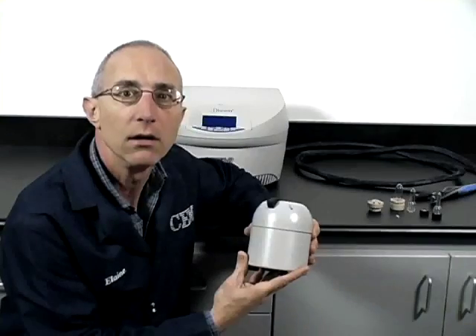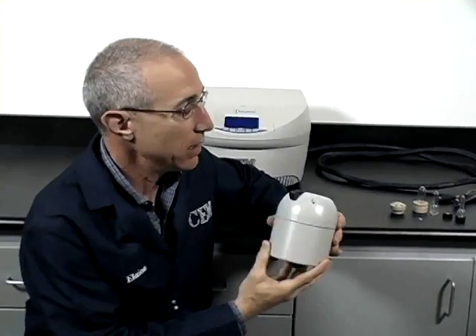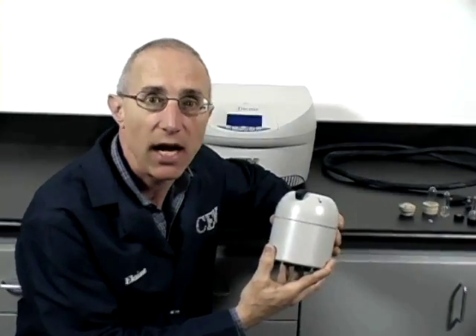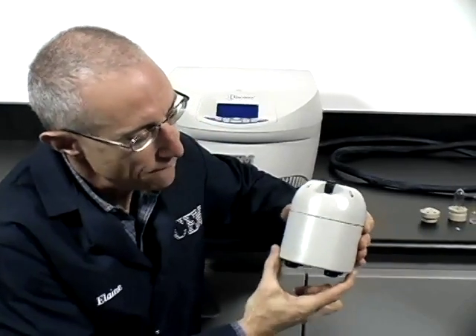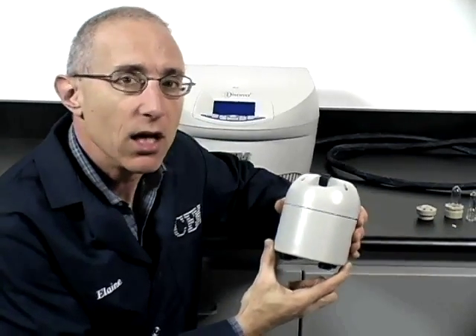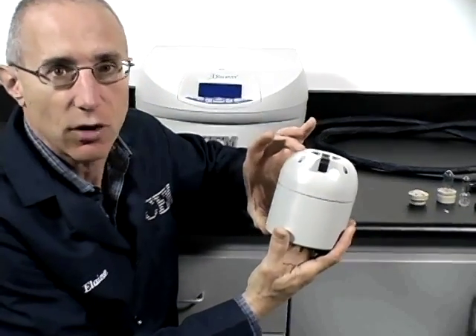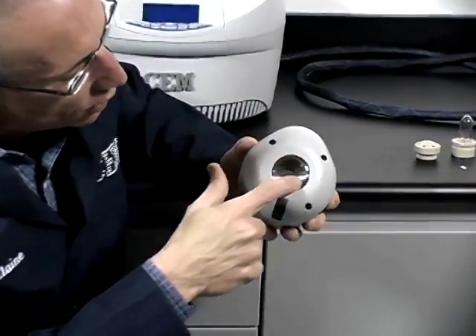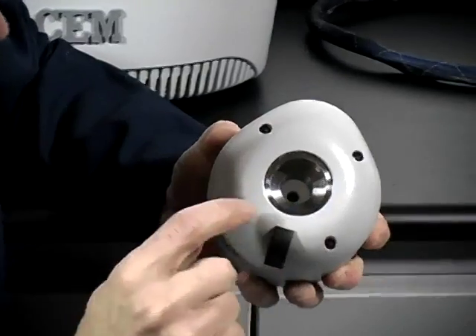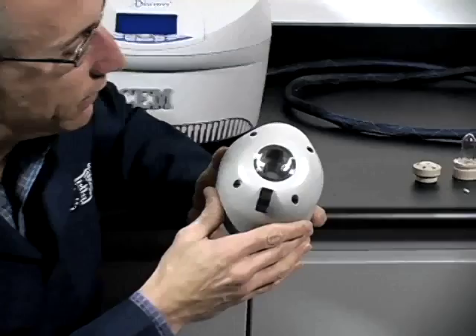Now we're going to go into further detail about each of the four components, starting with the remote cavity. The remote cavity resides in your glove box or hot cell. The cavity is about 4.5 inches wide, about 10.5 centimeters. The height is right at 5 inches, or about 12.6 centimeters. The vessels go in at the top, with an access opening of about 0.8 inches or 2 centimeters — that's the outside diameter of the vessels.